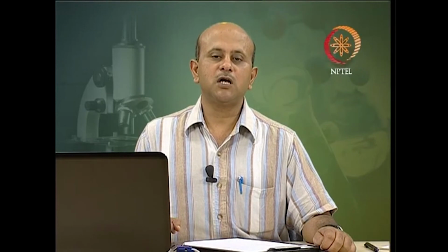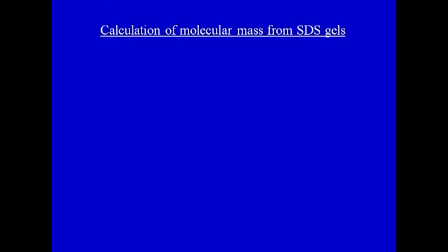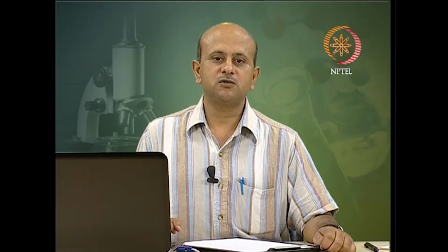SDS-PAGE is widely used, as we say, for calculation of molecular mass. So, you can identify the protein and get some information about it. Now, molecular masses of proteins can be estimated by comparing the migration of proteins of interest to standards of known size.